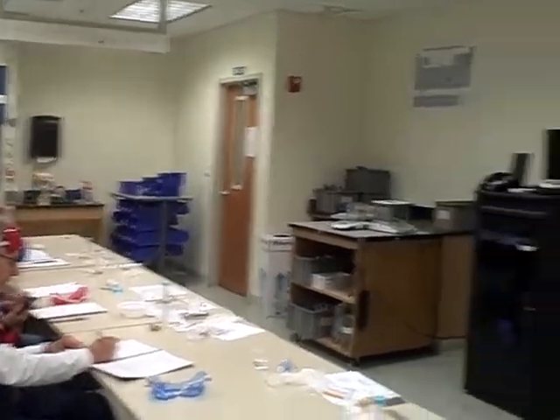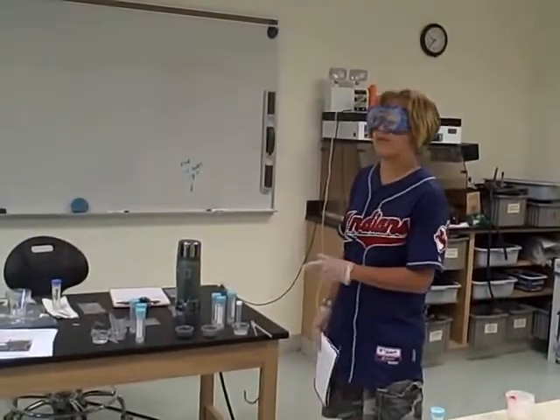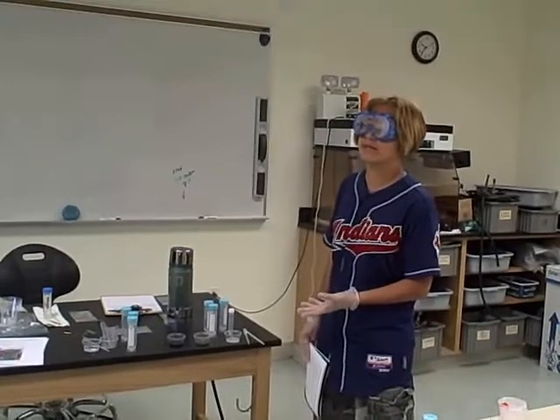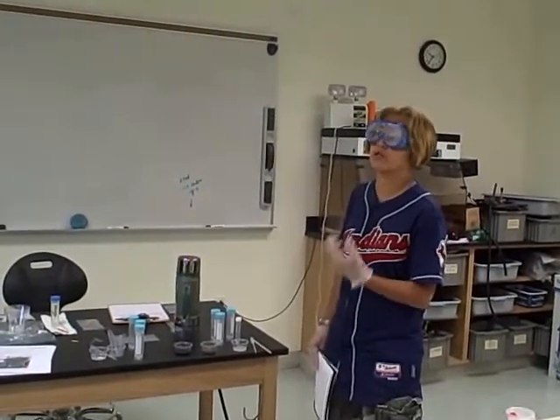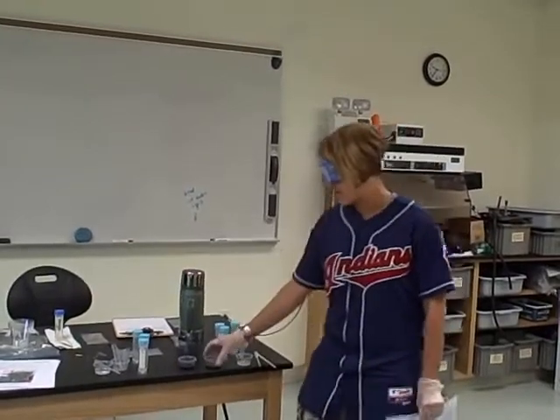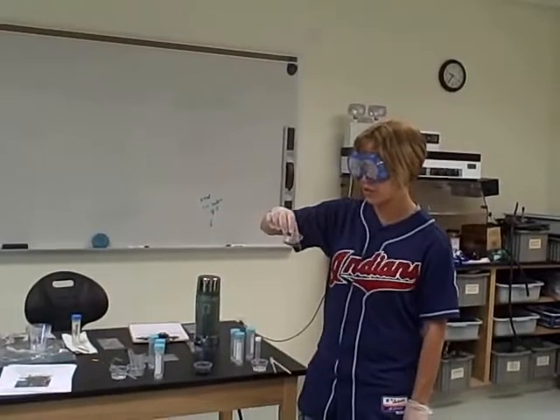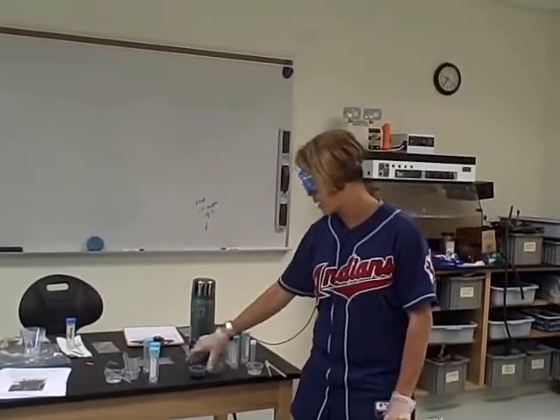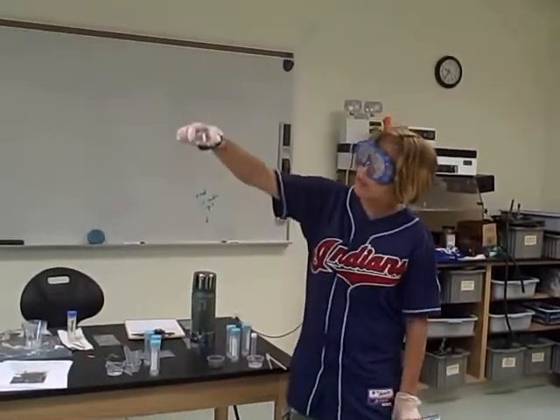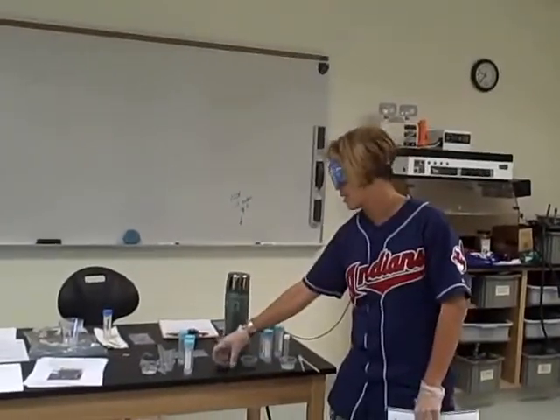The issue really was that I had considered that when I weighed out the borohydride, but I didn't want it to happen to the point where you'd be dripping and not see anything. Okay. So I think this is actually really good, it's trying to change color again. And this guy is actually starting to go pink. You can't see it from where you're at, but yeah.